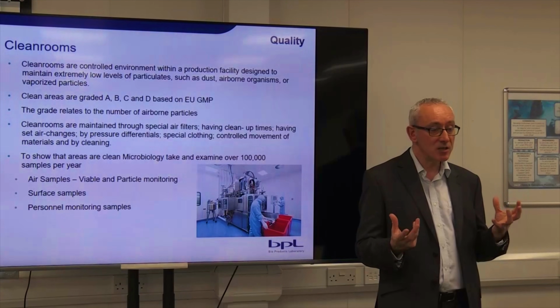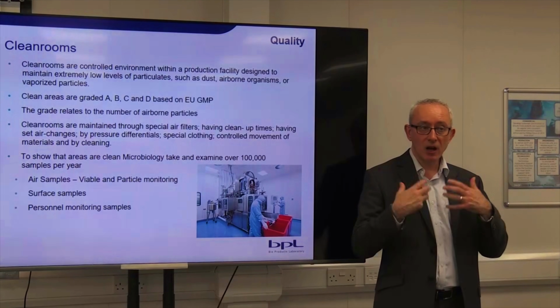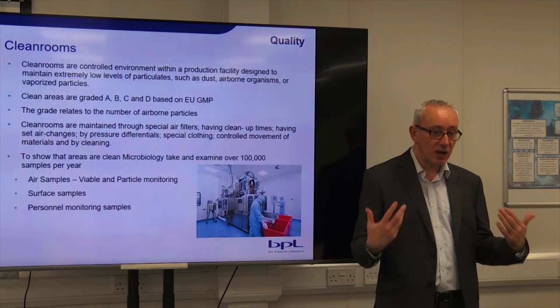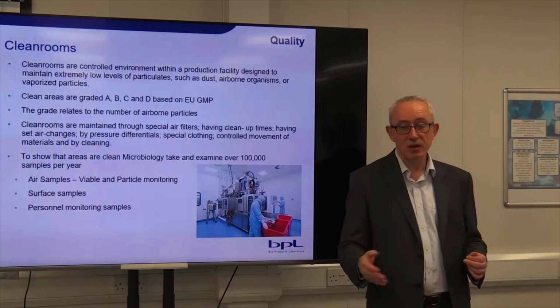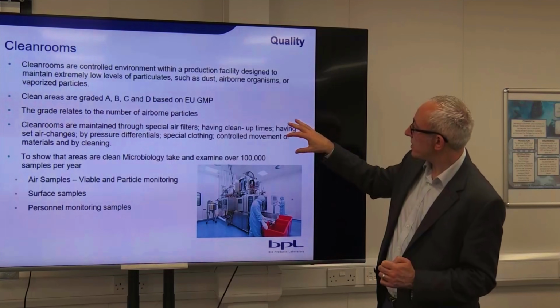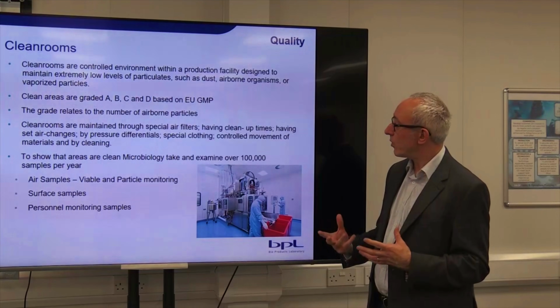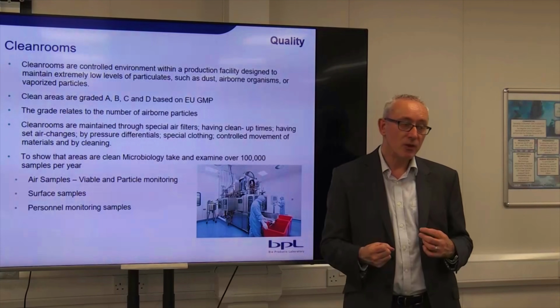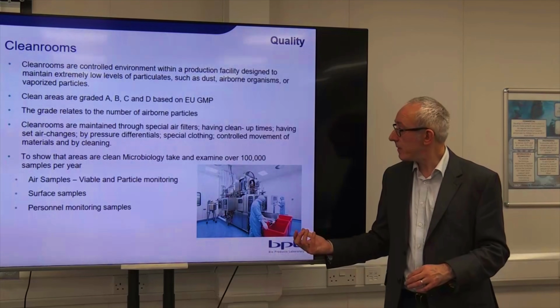of key concern. But the whole concept of the clean room is that you have clean air and clean surfaces which minimise the potential for the product to become contaminated. So there's a number of concepts which go on to make the clean room clean. So the air is filtered. We'll have a look at one of the filters in a minute.